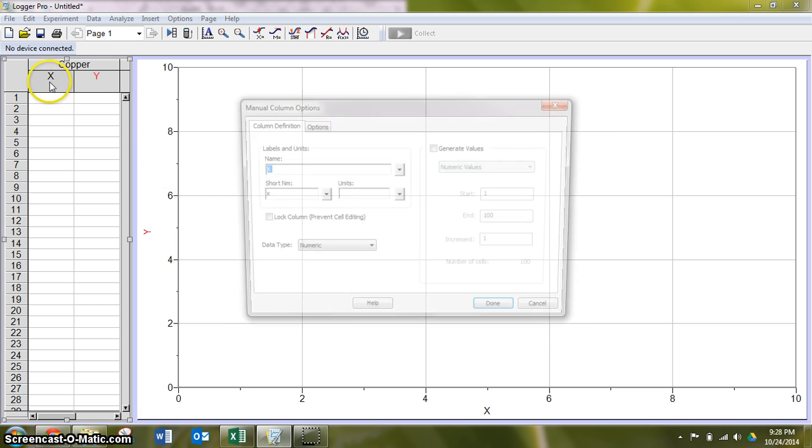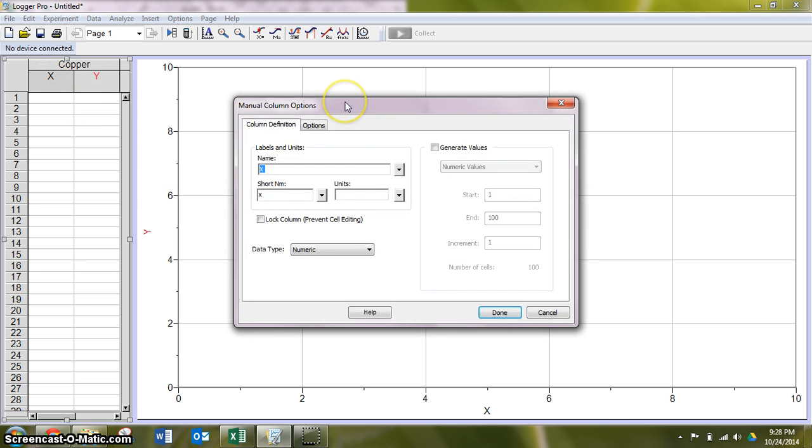We still manipulated the same variable, so I'm still looking at concentration. And our units were still parts per million or ppm.